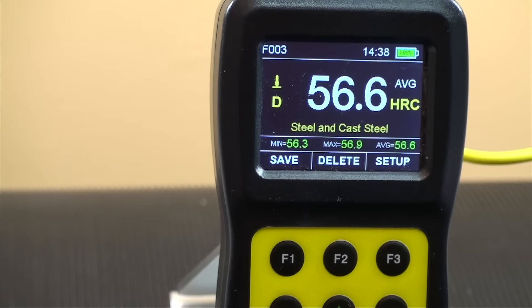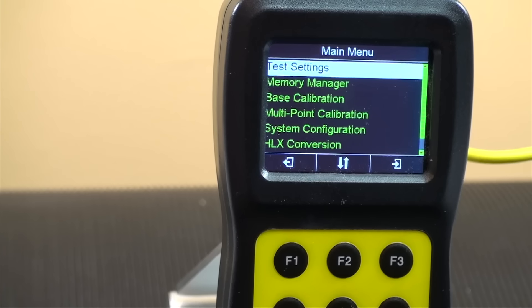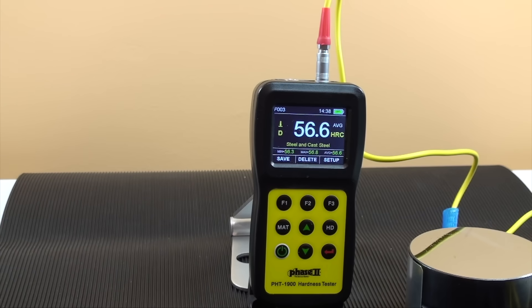The setup key allows you to enter test settings, tolerance limits, memory manager, base and multi-point calibration, system configuration, and conversions. This concludes our application and function guide for the Phase 2 PHT-1900 portable hardness tester. Should you have any questions, please do not hesitate to contact us.